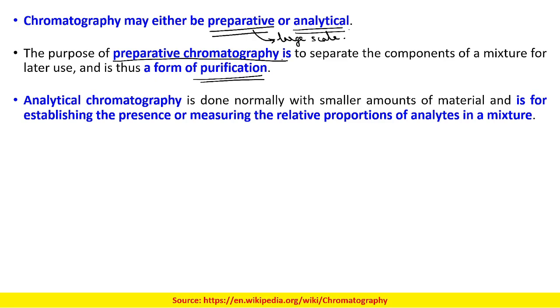Preparative chromatography is used to separate the components of a mixture for later use. You are not using it at that time, and it is thus a form of purification. Whereas analytical, as the name suggests, is associated with analysis.